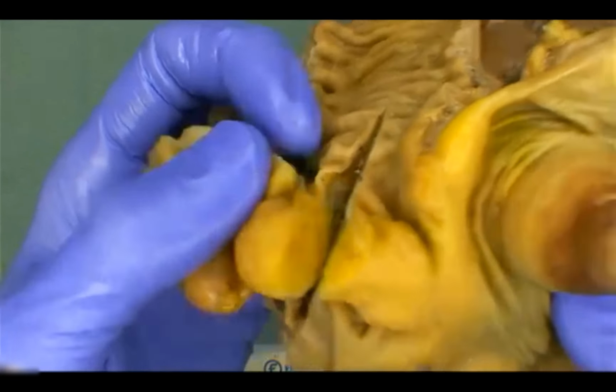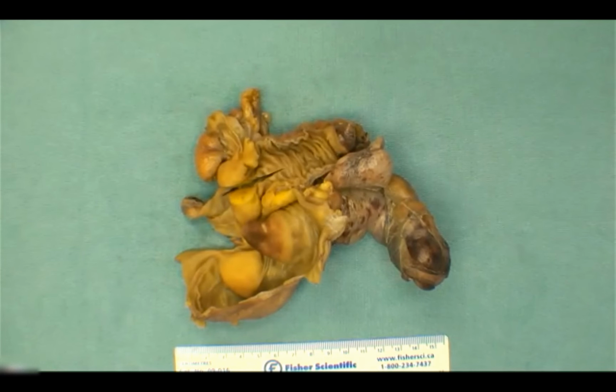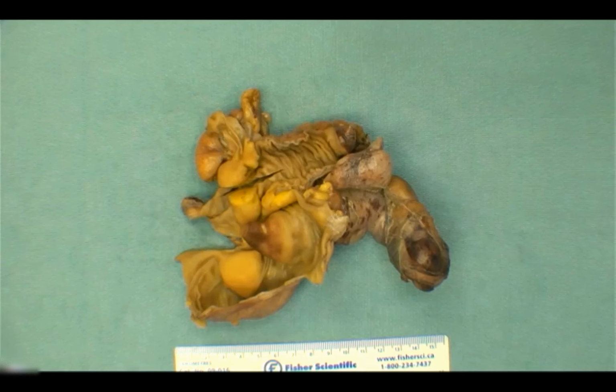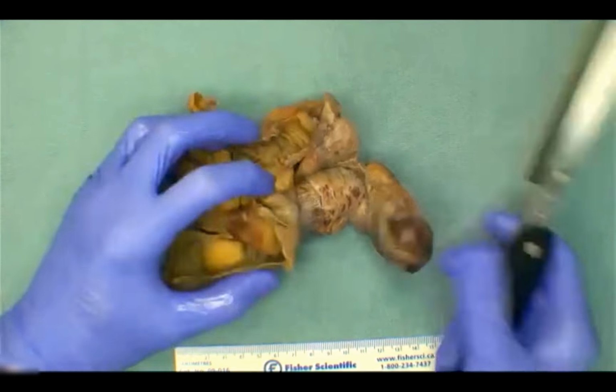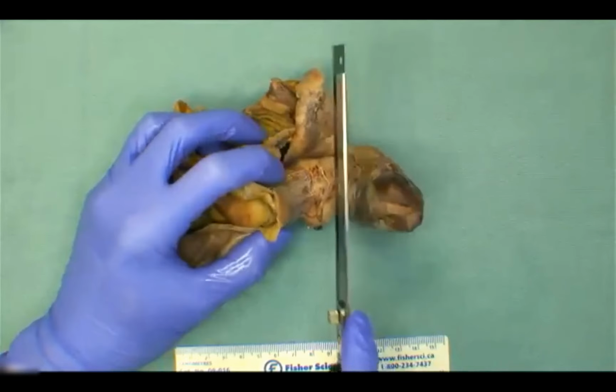Okay. So going back to our main pathology, what do people favor based on what we're seeing in terms of what we provided as a differential? And what do we want to see when we cut this? If we're going to cut this, should we cut this? I think so. I feel like we have to cut this. Use your reaction buttons. Thumbs up for cutting it. Okay, so let's do. All right. Here we go, folks. Let's find a good spot here.